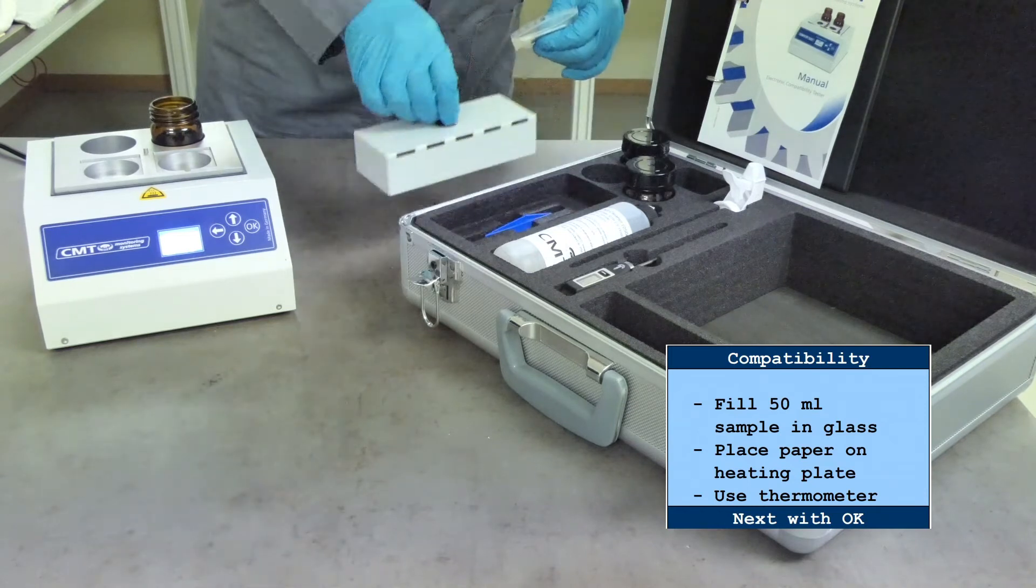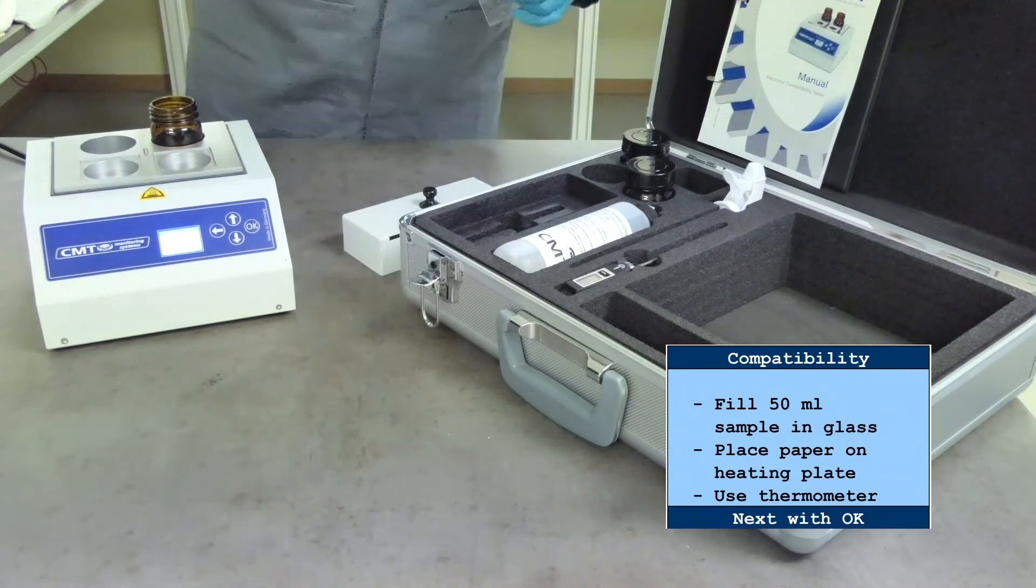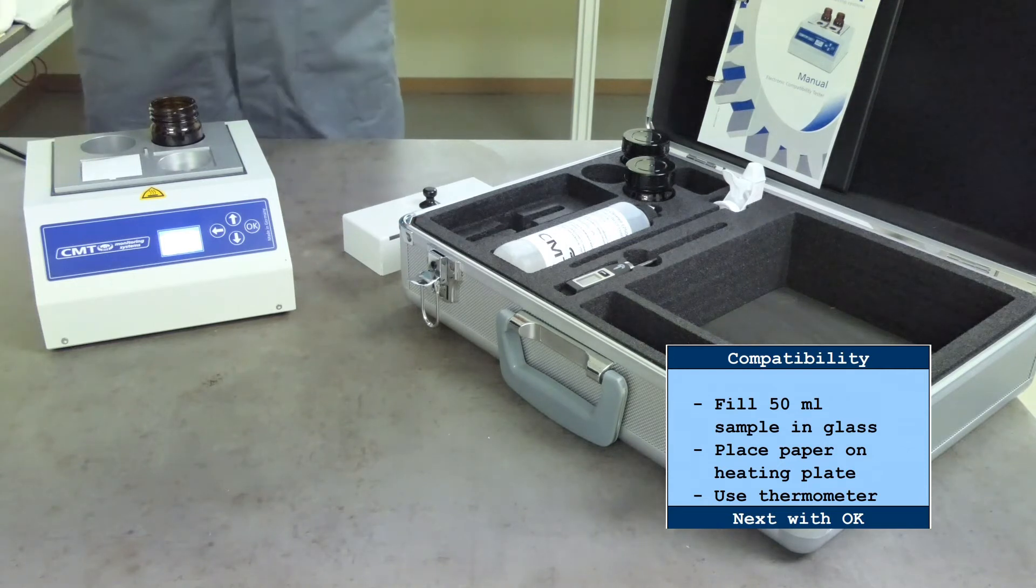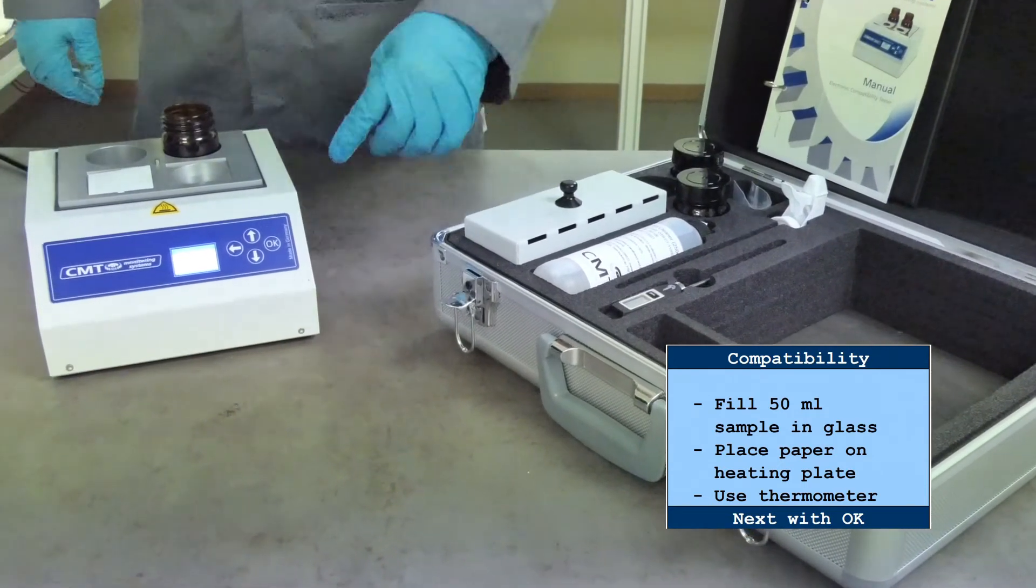Put a test paper in the square hollow of the heating plate, allowing it to heat up to the heating plate temperature. Press OK to start heating the sample.